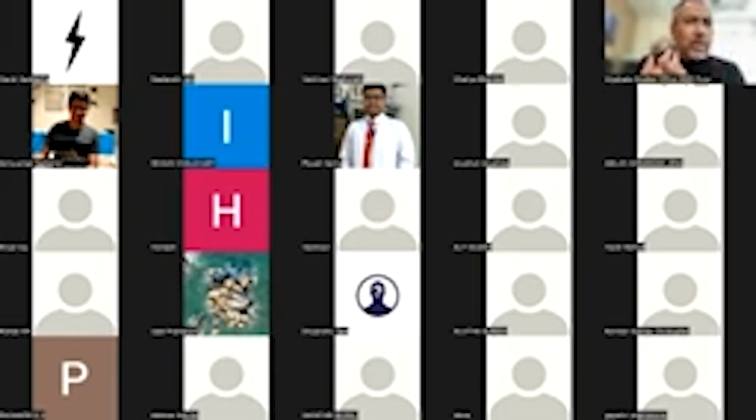So in studies with embryos, there are labs in IISER, for example, that look at Drosophila embryos. You're able to visualize live events that are happening in entire embryos because of these capabilities. But you can see inside the cell, if that's the query, right?